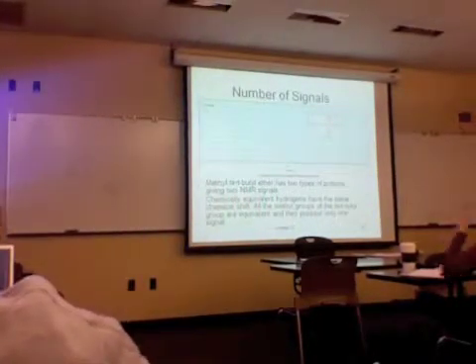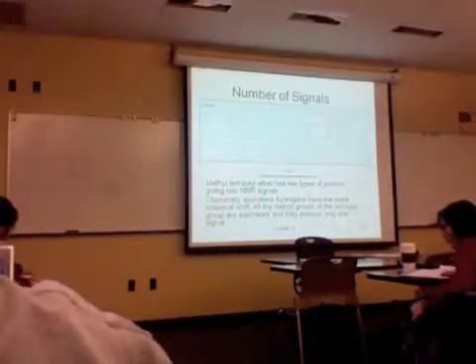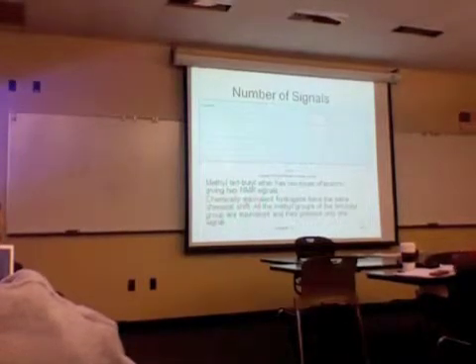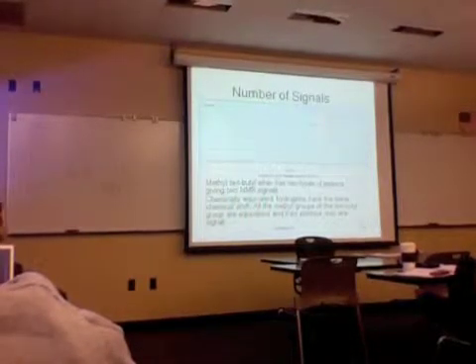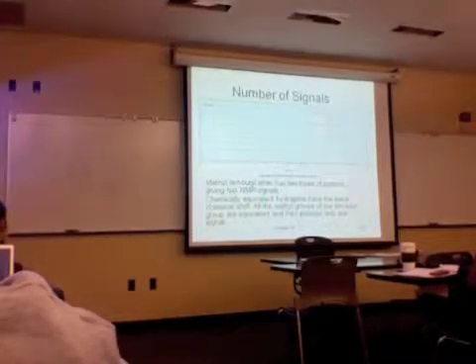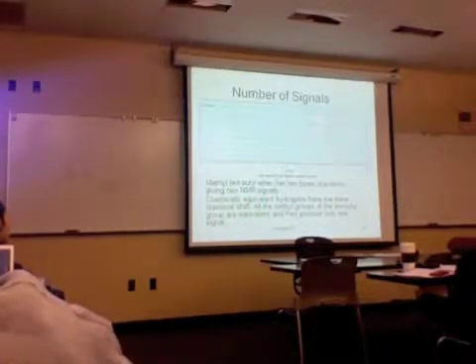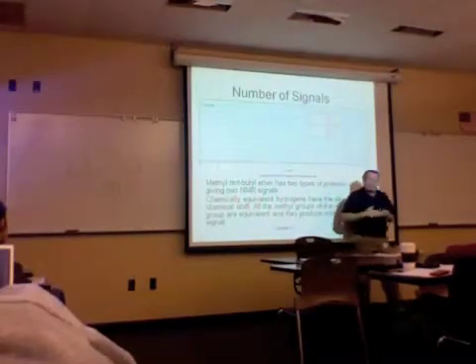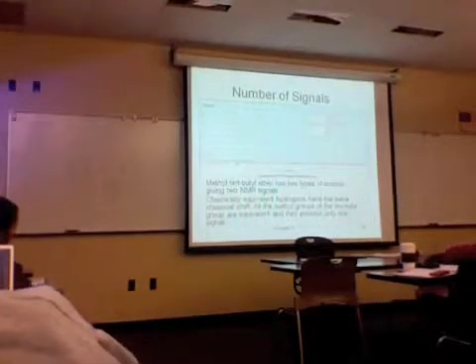Another thing that we look at in NMR that's important to us is recognizing the equivalence of protons, because this tells us how many signals we expect to see. These 3 methyl groups are identical to one another because they're attached to the same carbon. And remember, because of rotation around this bond and around each of these 3 bonds, these hydrogens experience the same environment. So they're identical to one another, so they appear as one signal. These 3 hydrogens over here are identical to one another, and they appear as one signal. And so when you're looking at NMR spectra, you need to recognize the equivalence of hydrogens.